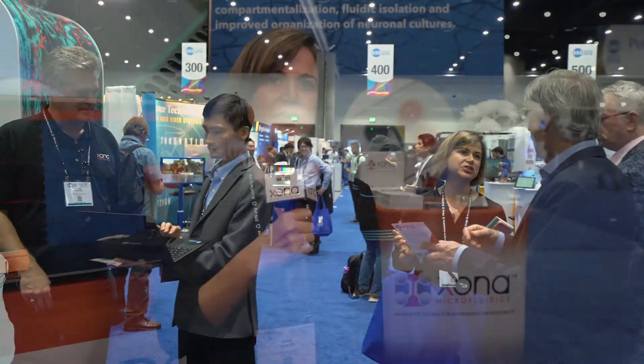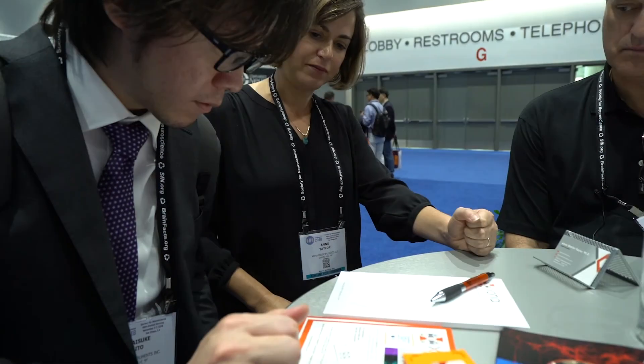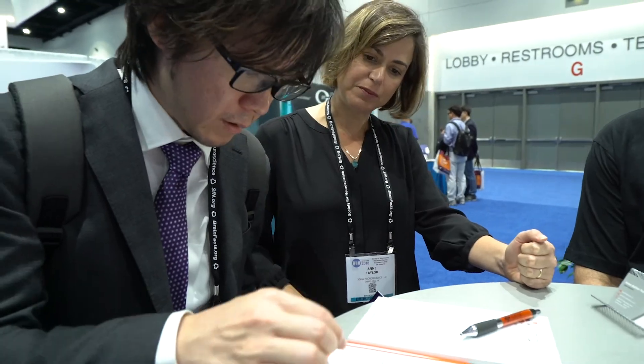Xona had a great experience — we visited with many customers here who are really interested in using the new Xona chip line of products. We also met with a lot of people from companies interested in collaborating with us. It's been a fabulous time and we got a great response from everyone who came to attend SFN 2018.